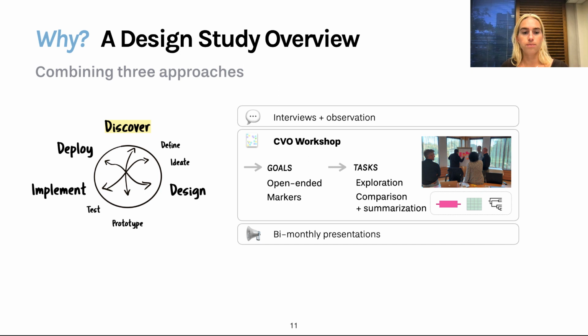For both goals, the tasks revolve around locating and browsing interesting regions of conservation or variation to then explore those regions in more detail, considering the sequences but also annotations and evolutionary relations and metadata. And lastly, comparison and summarization aspects to broader consider the genomic context. For more details on the task analysis, we refer to the paper.